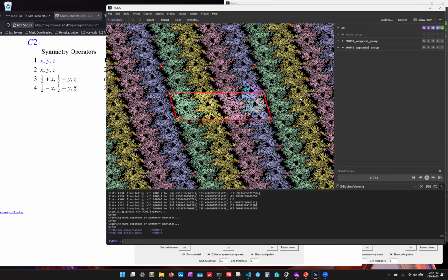They have some generate symmate functions, but they're kind of crappy. So I wanted to make a script to do this automatically because I found myself doing it a lot. Let me give a little tutorial on how to do this.